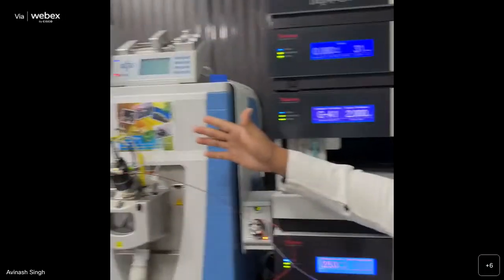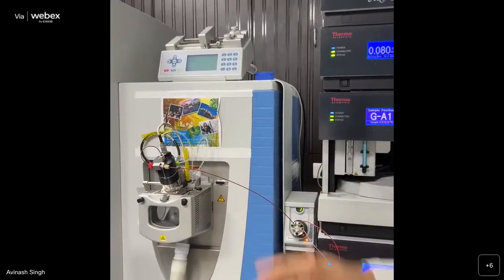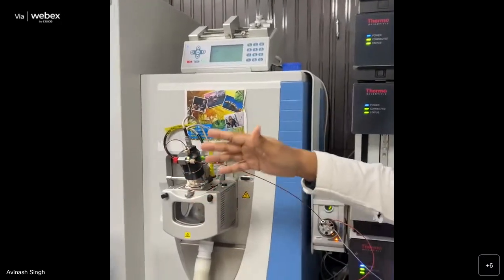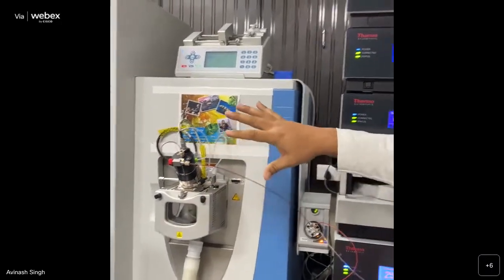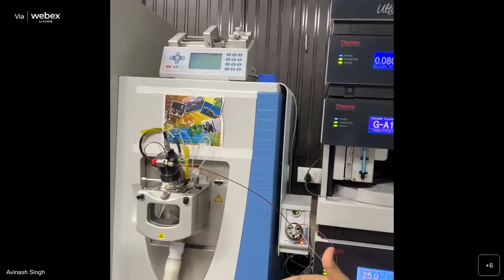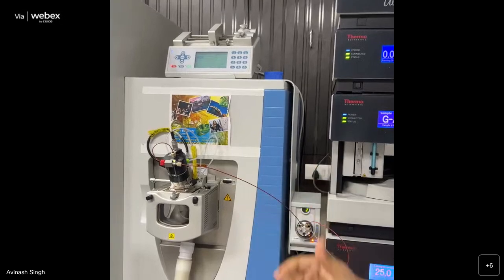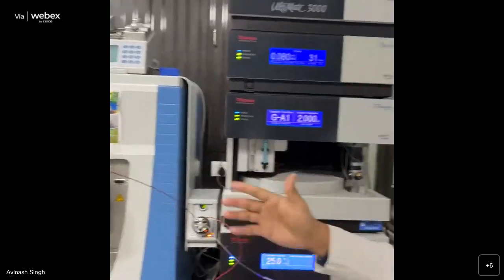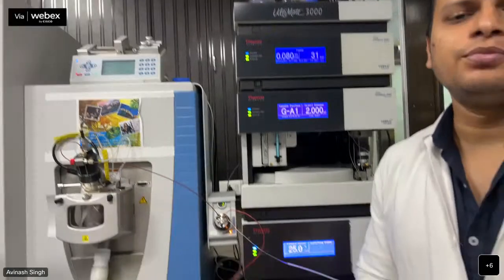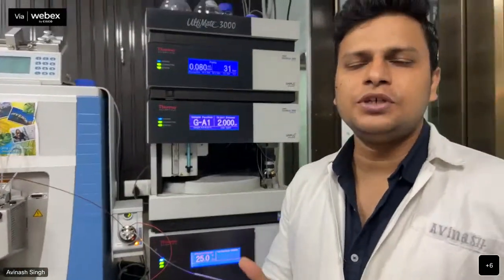So this is another mass spec instrument, the Q Exactive. It basically has two mass analyzers, one is the quadrupole and the other is an orbitrap. With both analyzers, this instrument is very good for detecting small molecules and drugs from different clinical samples. Here we are using this instrument for metabolomic studies, small molecule screening, and different kinds of small molecule detection.